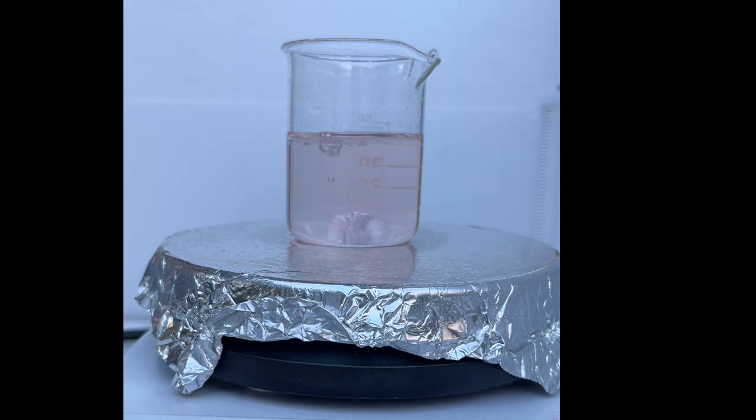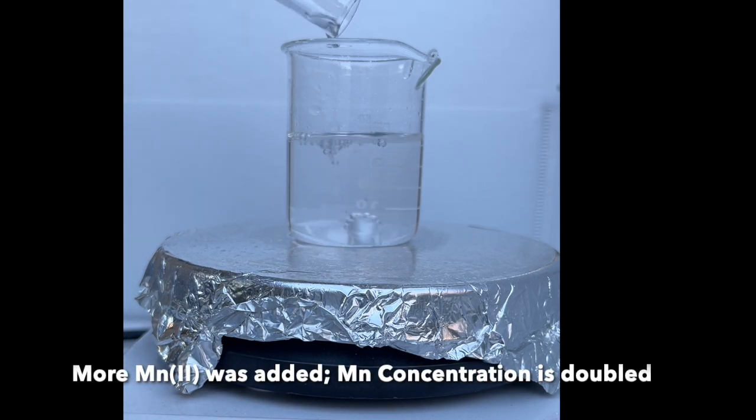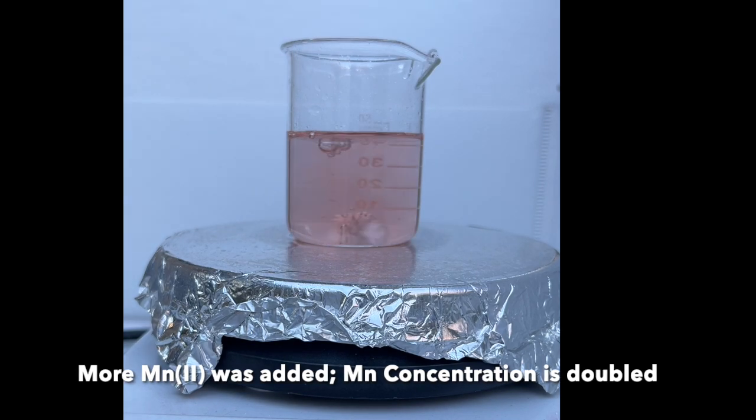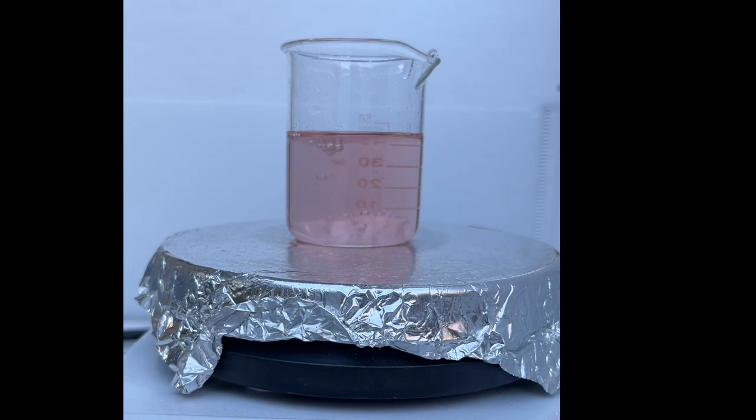Naturally, we wonder if we add more manganese catalysts, will the color change become intensified? Let's find out. In the same solution, we will add another 1.8 milliliters of the manganese sulfate solution. From now on, the concentration of manganese catalysts will be doubled. Let's wait for the oscillation to begin and observe the results.